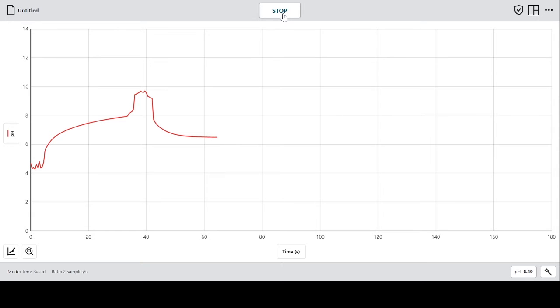And again, that is due to those little chips dissolving, and then the solution will have an equilibrium dynamic that takes place between the more acidic substance and the more basic substance, and then they'll be equivalent, or equilibrate out into the numbers that you guys see here.